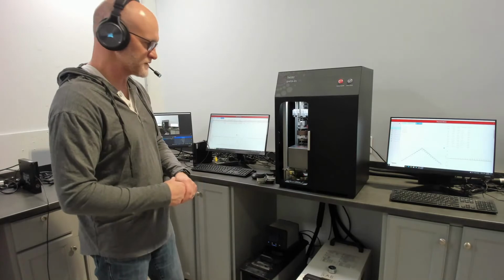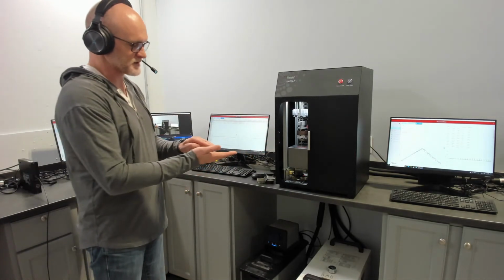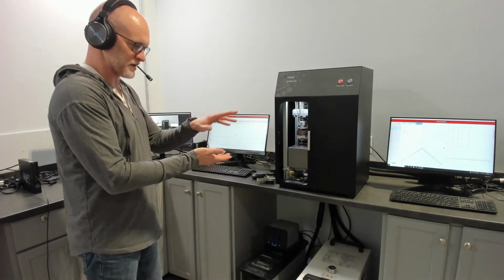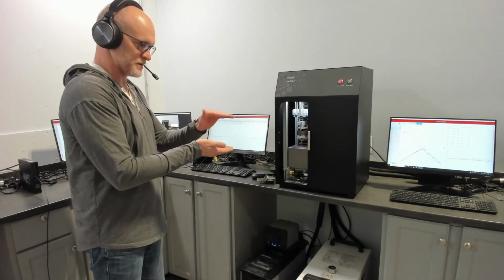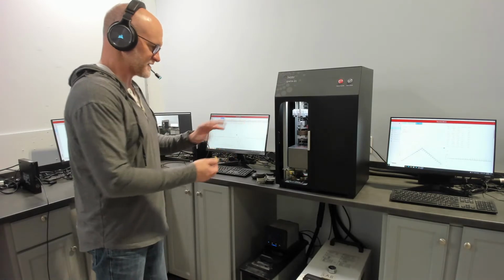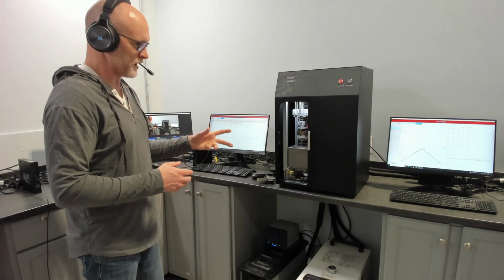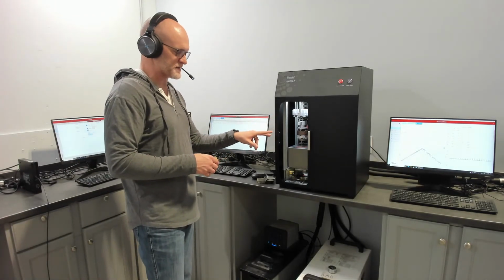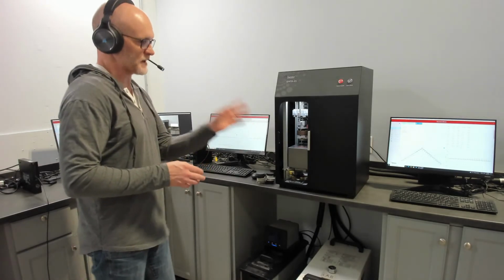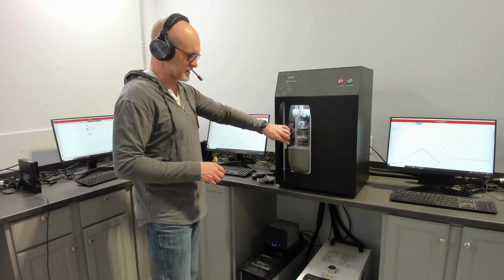This can measure thin films as well, as defined by the standard. The thin film approach to this is to layer several layers to a minimum layer, measure that, and then layer more layers to a second minimum thickness, and then more layers to a third minimum thickness. That's all captured, well defined and published. It works quite well. Obviously, each of these measurements can take time, and it does present some complexities, but it's one of the capabilities. I mention that because it does tie into what we're going to talk about. So it's a very important method following ASTM E1530.